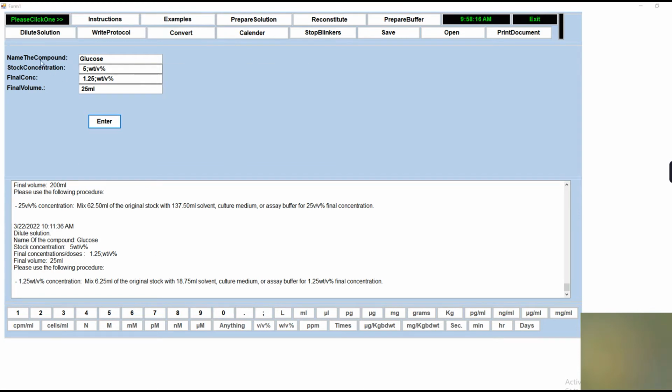Like this, I also covered parts per million and CPM, and if you are diluting cells, you can use it. Here it basically has only a label value. When you use ppm, the solvent must be water. So that is about the dilutions. Actually, you can explore them using the examples also. Thank you.